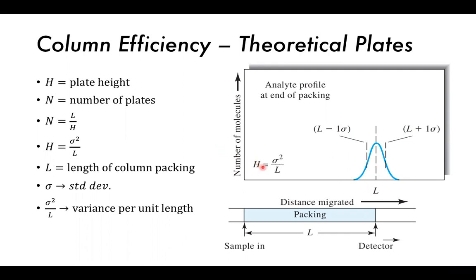And so the height is H equals the standard deviation squared over L. So this is a distribution of molecules that comes through.